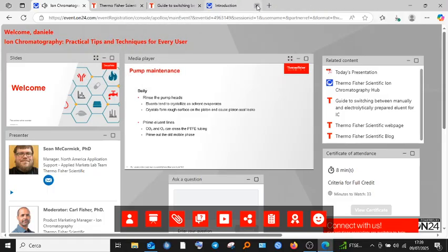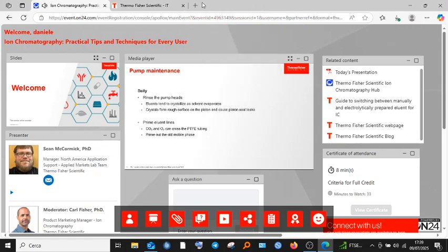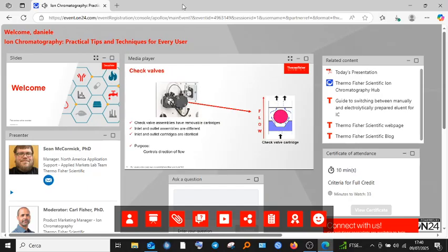In addition to rinsing the pump heads, we should also prime the lines. The eluent lines are susceptible to picking up carbon dioxide and oxygen, which can easily pass across the Teflon. This creates many bubbles, which can cavitate in your pump head. Another benefit of priming your lines is that you remove old mobile phase and allow fresh mobile phase to be used for your analysis.